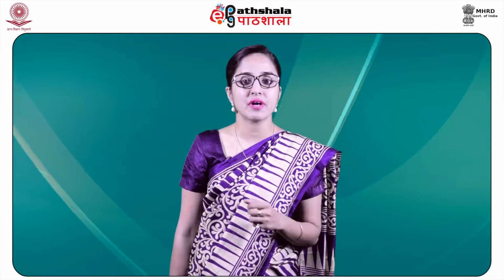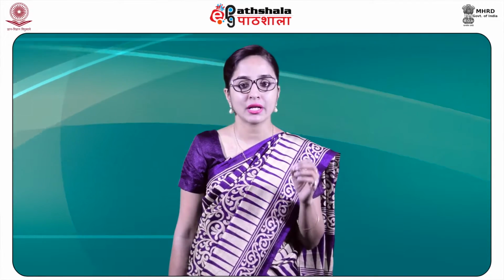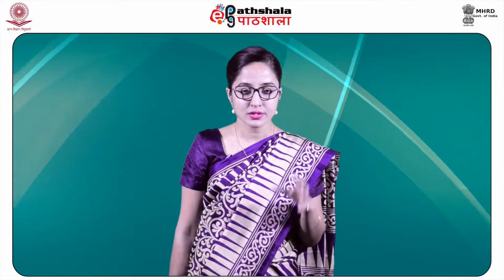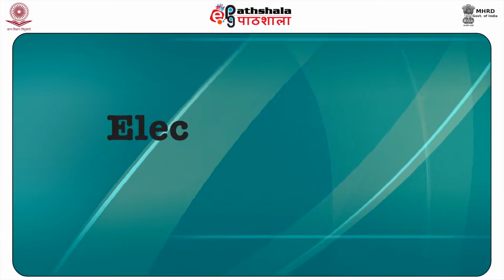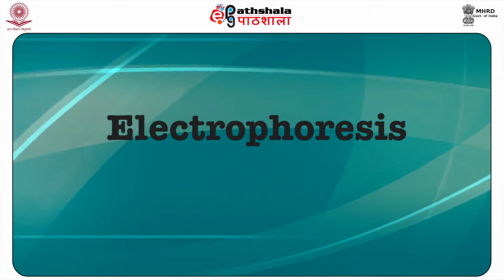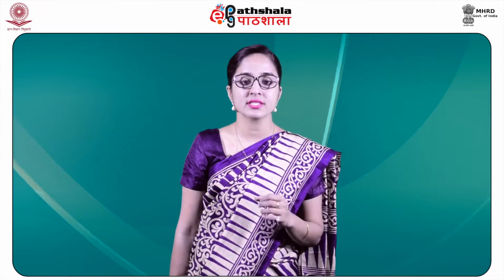The majority of isotopes which are used in biological research emit beta radiations, that is beta rays, and are considered to have a biological effect that is very similar to X-rays. So one has to be very careful while using the radioisotopes and the techniques which use the radioisotopes. So let us now move on to the first topic of discussion, which is electrophoresis. What is electrophoresis?